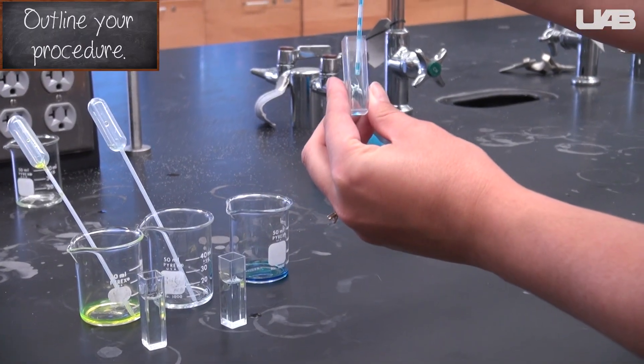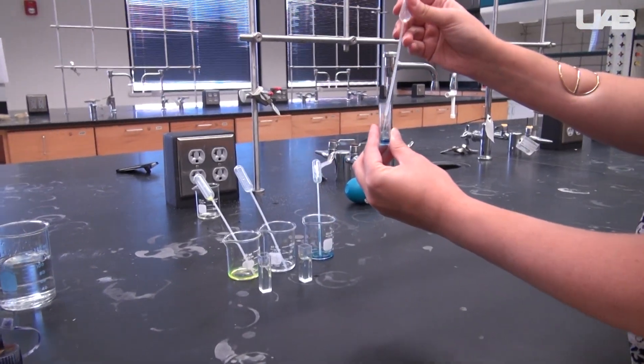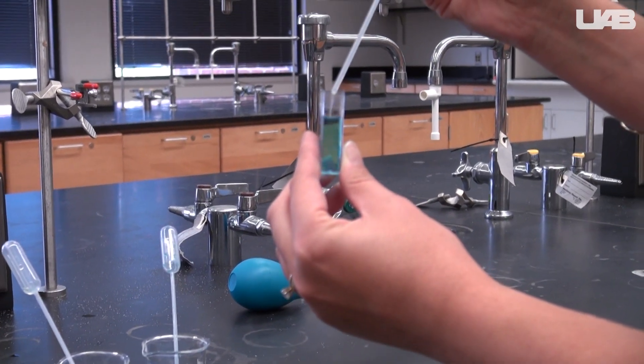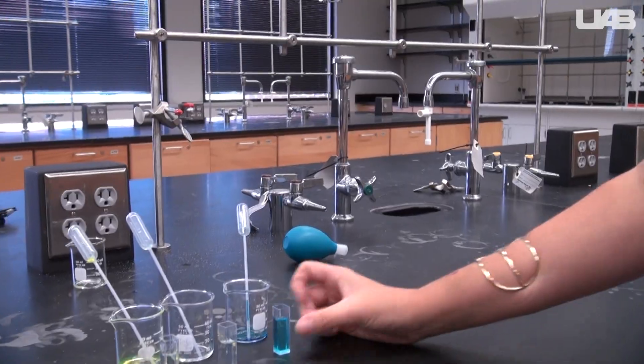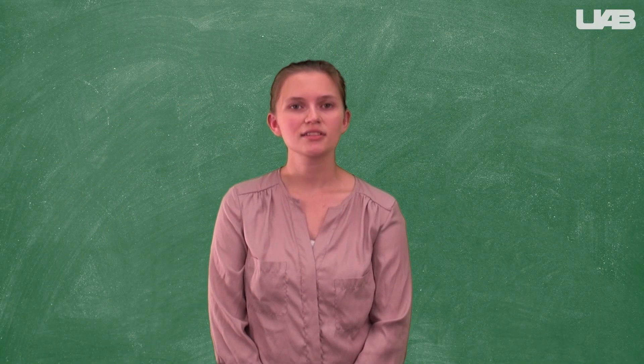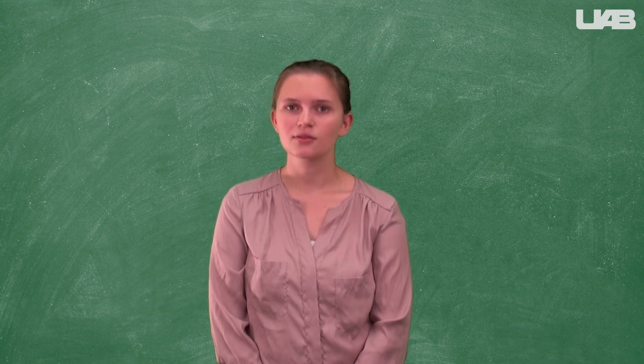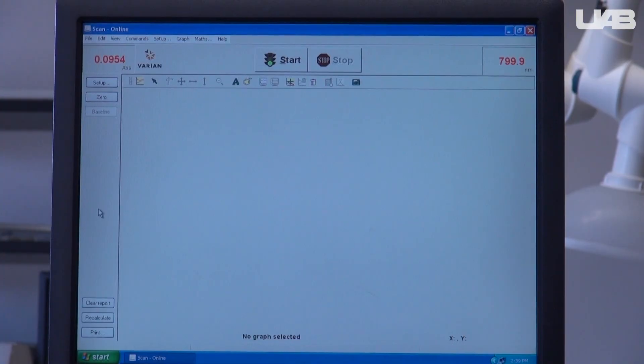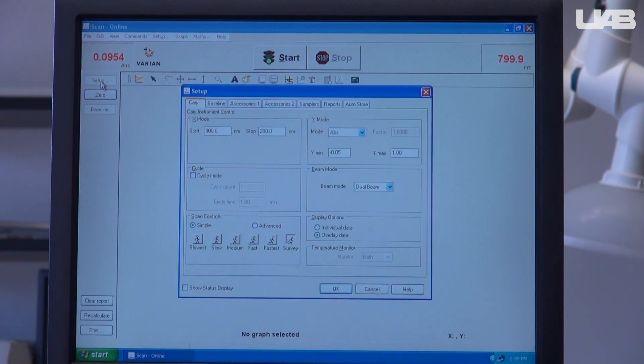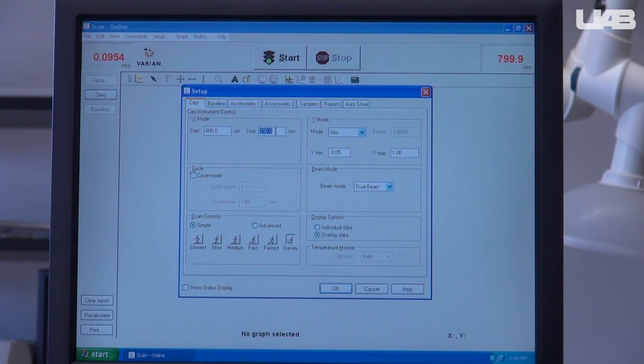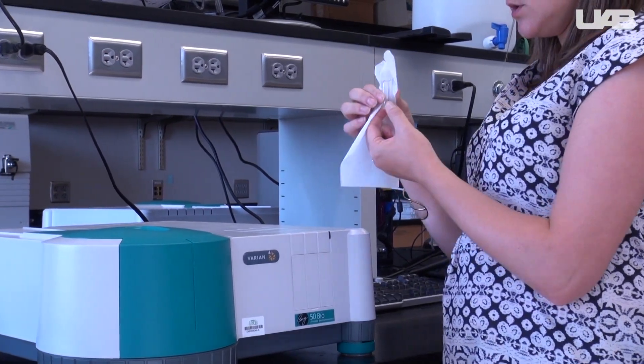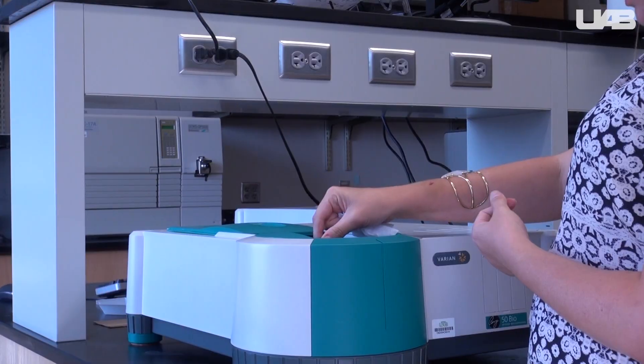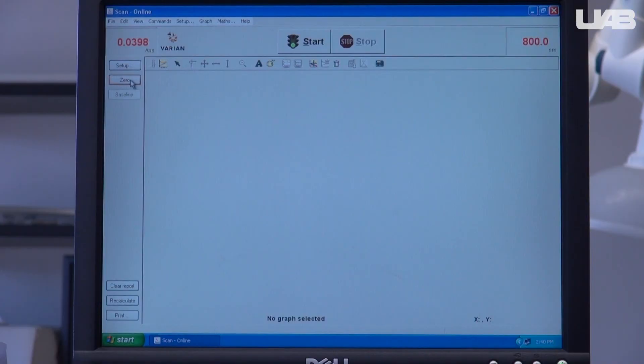Once you have collected each fraction, take a small portion from each and place it in a separate cuvette. Dilute it up to the mark with deionized water. Use the spectrophotometer to collect a UV visible spectrum from 800 to 200 nanometers. You will take the cuvettes with the colored solution along with the blank, a cuvette filled with deionized water. Open the scan program and select setup. Make sure it is set to record from 800 to 200 nanometers. Hit OK. Take your blank cuvette and a Kimwipe and clean the two sides of the cuvette that the light will pass through. Place it in the spectrophotometer and close the lid. Press zero on the computer.